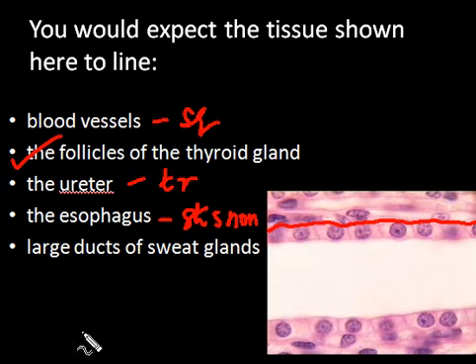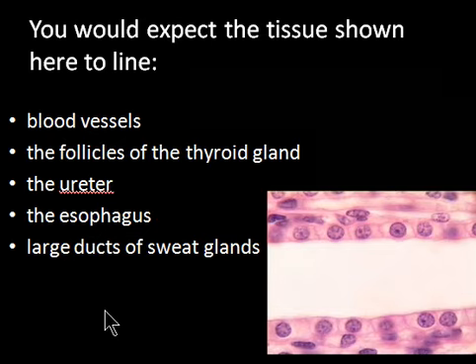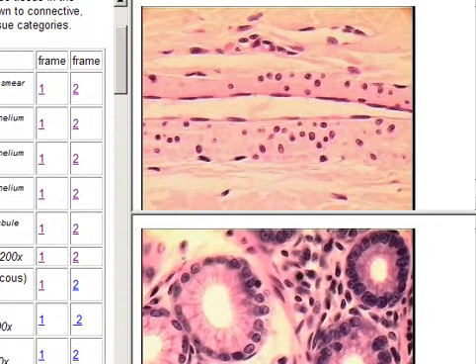And just to show you how these other epithelia differ from the one shown here, I'm going to the site from where that image was taken. This is showing you simple squamous epithelium, where this is the basement membrane, and here you're looking at the nuclei of squamous cells.